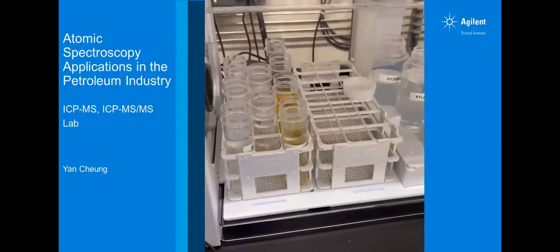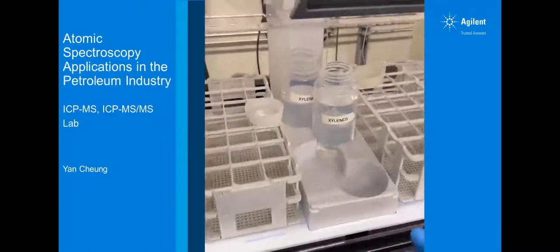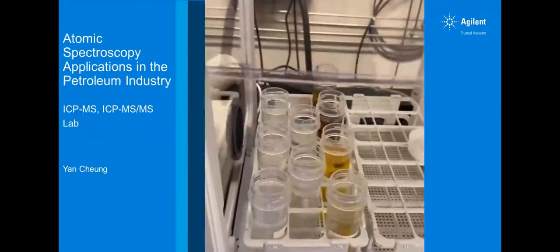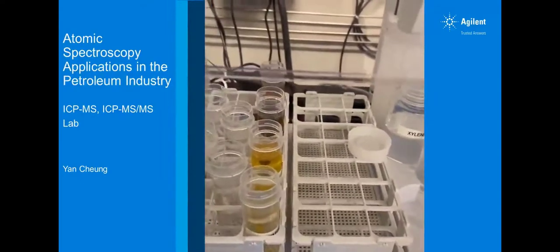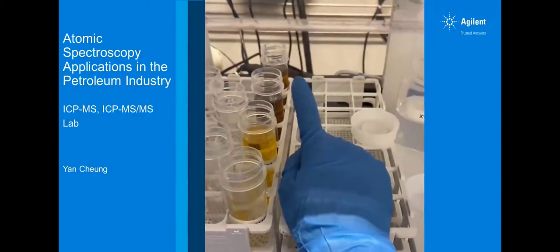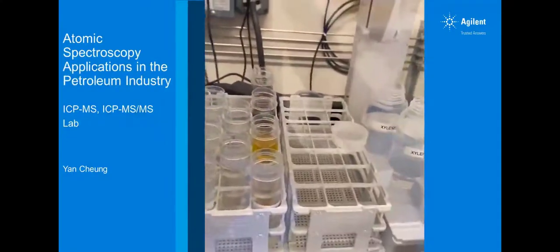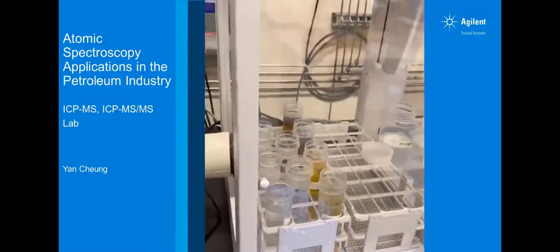Okay, I have my standard prepared, the sample diluted, and as you can see I use xylene as my rinse. This is the rinse tray. Now I have all the standards ready, and then the sample that is prepped, the one in the back there is the sample that I was showing you that was very hard. Then it's all ready to go for my day of analysis. My instrument is ready and the sample is prepped.